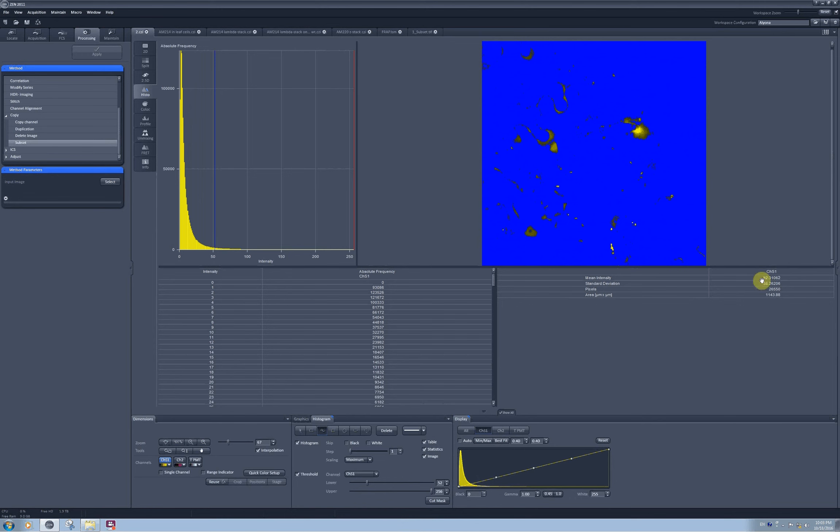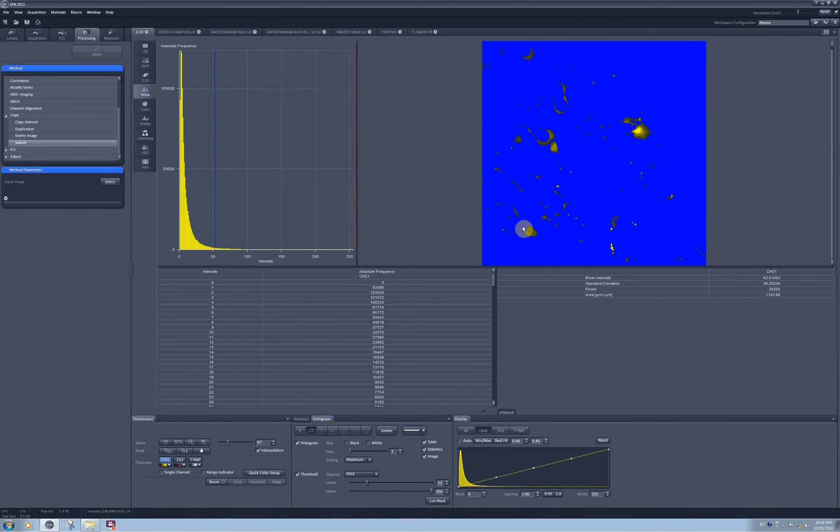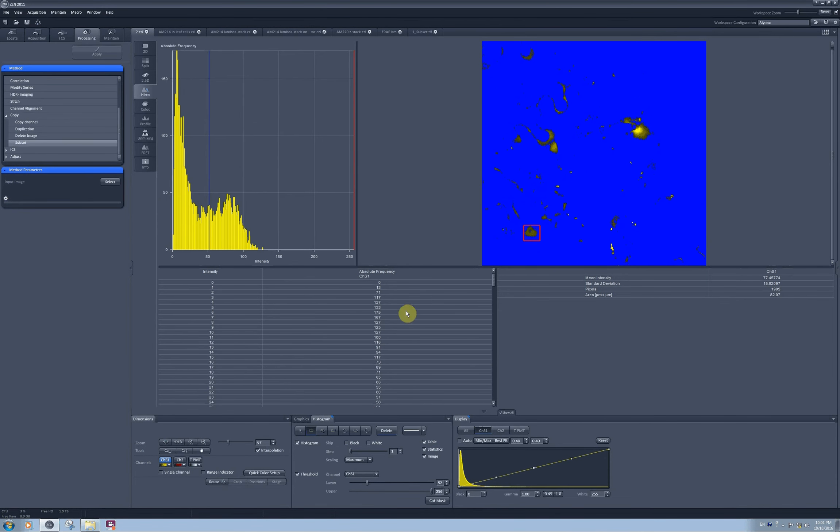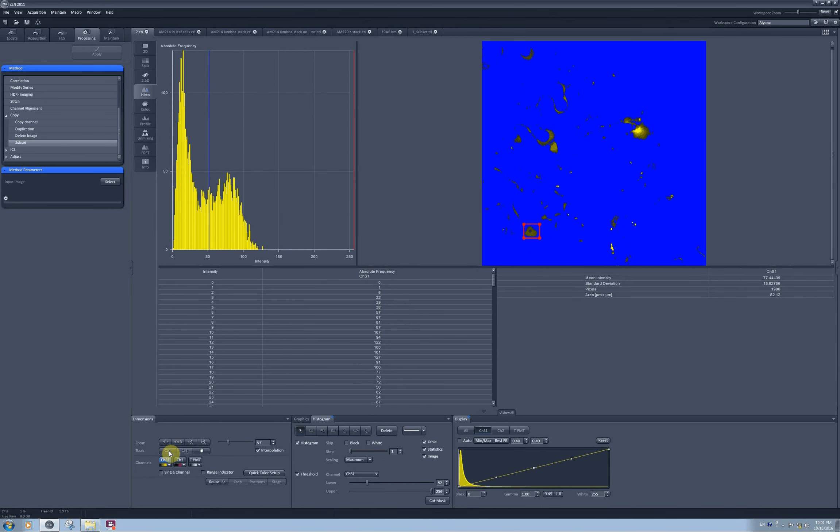You immediately can see that the area for quantification became much smaller because quantification now happens only in these areas which are still visible as yellow. Now it should be much easier to select the nuclei. I can do it even with a rectangle tool, and I can move it around with the select tool and resize it if I need.